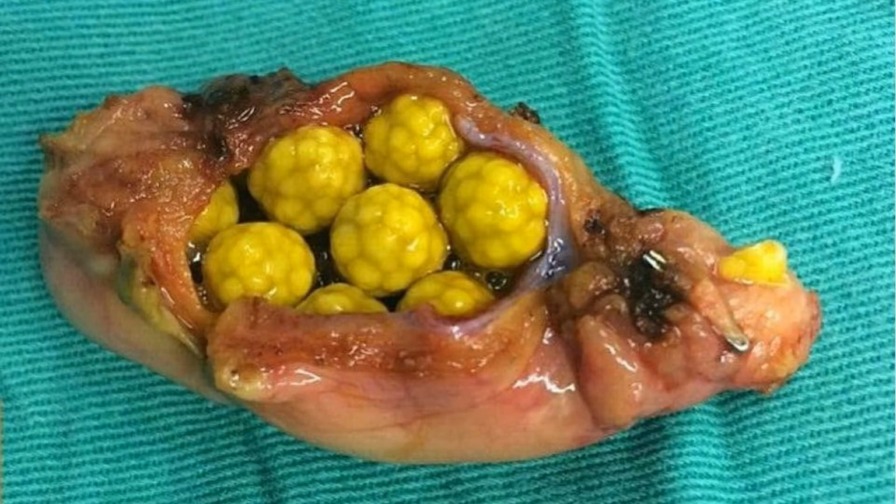Next is gallstone. You can see this is a gallbladder which is distended by multiple stones inside the pouch of the gallbladder, and the color is yellowish.